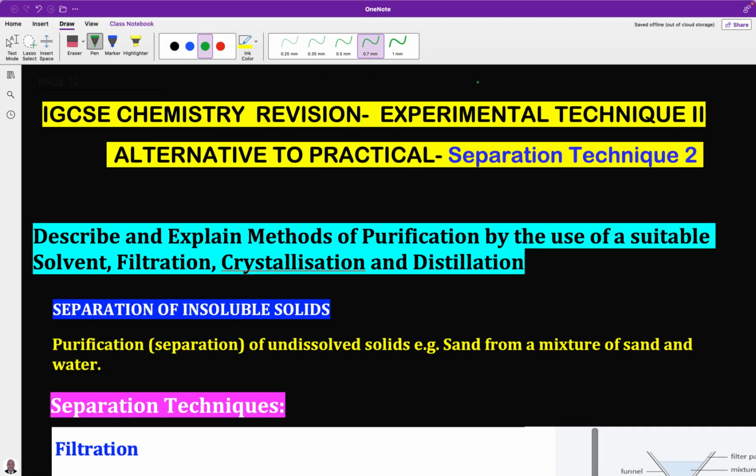In this video, we will be dealing with purification method 2 or separation technique 2. As you know, there are many methods of purification for solids and liquids. But firstly, the choice of the method of separation would depend on the nature of the substance being separated.